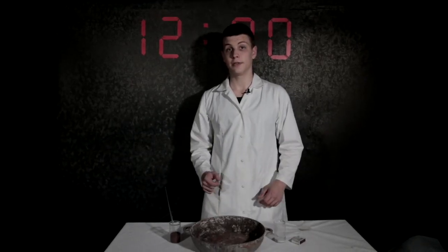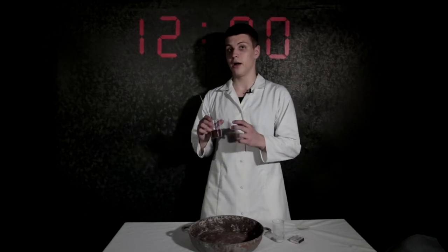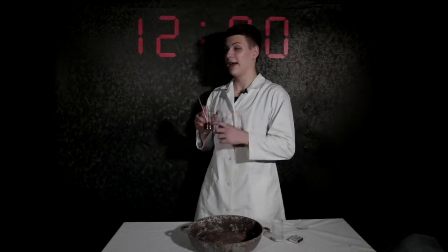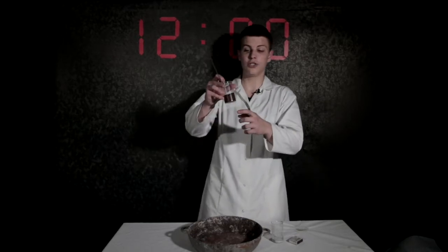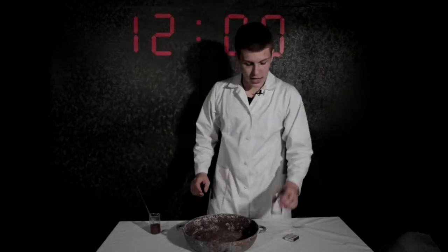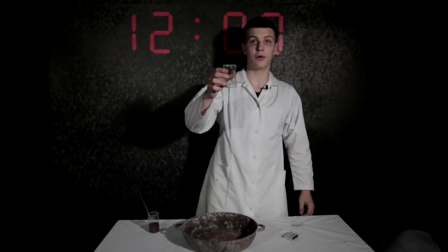Proceeding to the next experiment. Now I'm going to need the iron 3 oxide, which is iron 2O3. And why I have mentioned it on the table, it was orange color. You can see that, it's an orangish color. Okay. And we are going to need some aluminum powder.